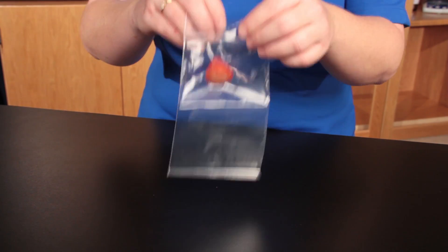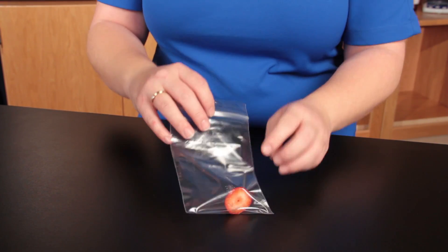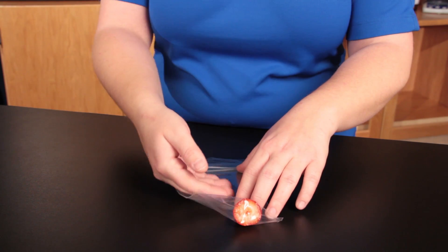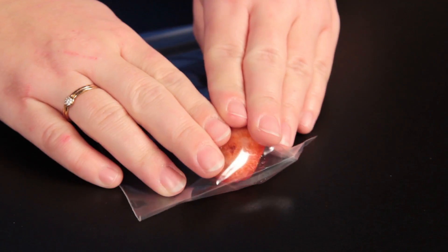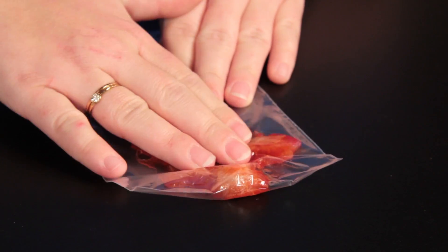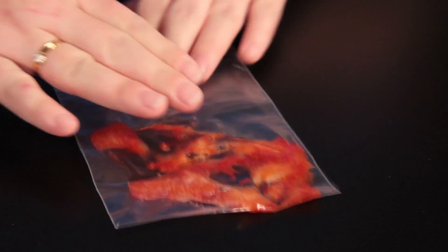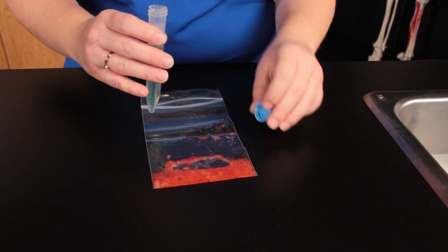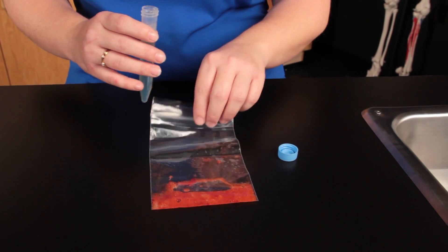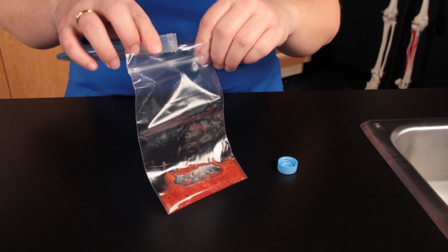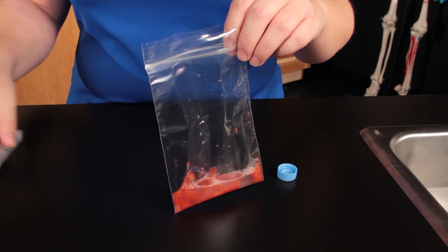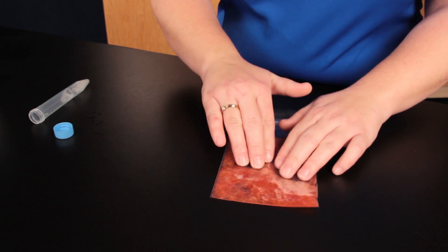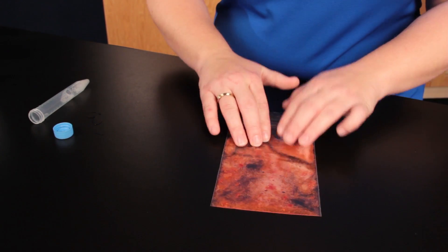Place half of a strawberry in a plastic bag, remove the air and seal it. Use your hand to smash the strawberry until it is pulverized. Add 10 milliliters of DNA extraction buffer to the bag. Continue to smash the strawberry for one more minute.